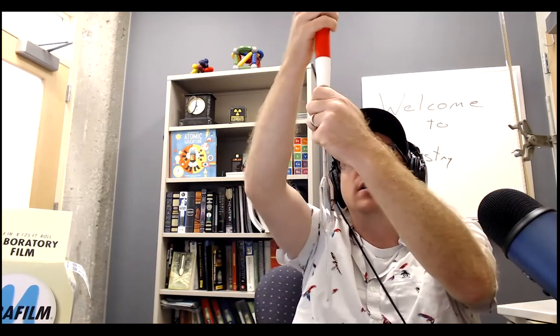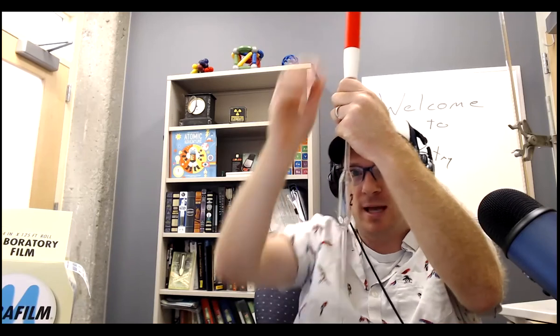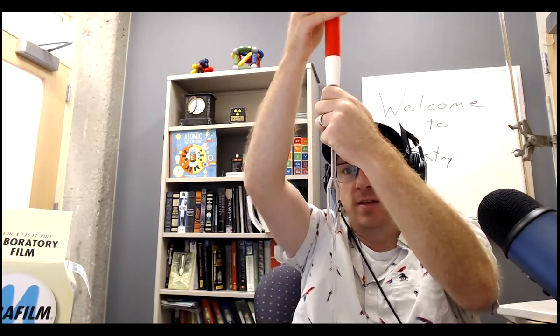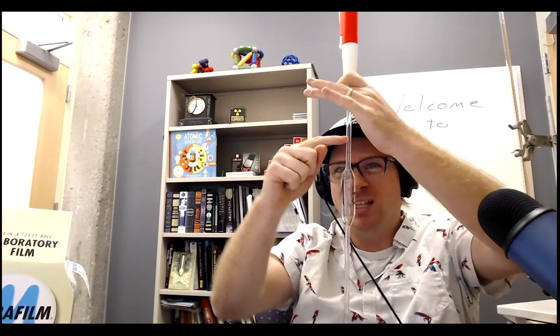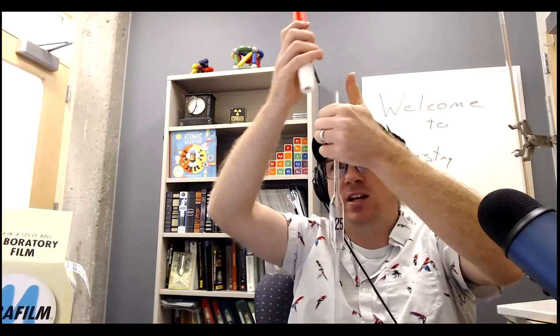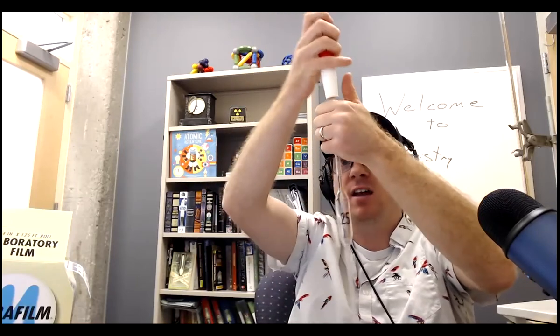It's going slow. Yeah, you're cranking it, and then it's getting up here. Maybe you want to slow it down a little. You could actually push it back down and you're like, oh, okay, I don't have any more pressure. And then you pull up slowly. You want to go a little bit above the line, and then you pull the aid off and cover it with your thumb. And in that instant, it will drop down a little bit. So you've got to be kind of fast.